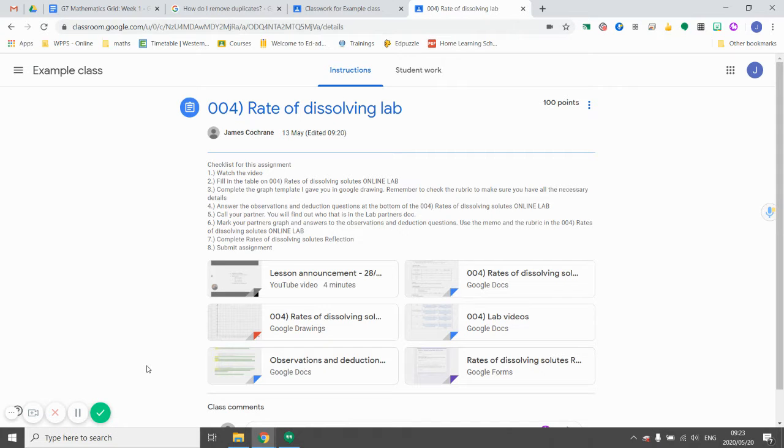This is your rates of dissolving lab. The instructions are all written out here and they are numbered. So I'm going to go through them. First, you watch this video to its completion. Then you're going to start the lab.